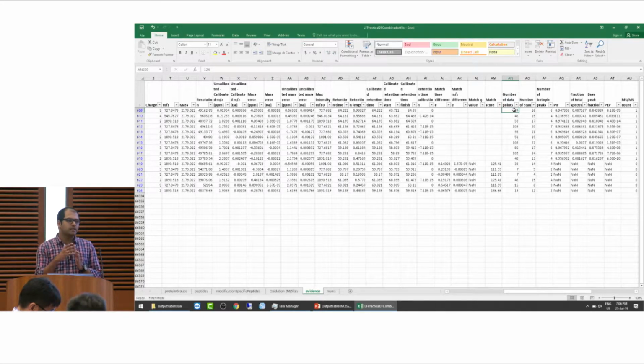That means the number of scans is at least 26, but this particular peptide had the C12, C13 isotopic cluster. So at least 124 times we can actually see that peptide, which gives confidence that it's not just one time looking at a scan. So you have information from 124 measurements. That's way better than just one Western blot.